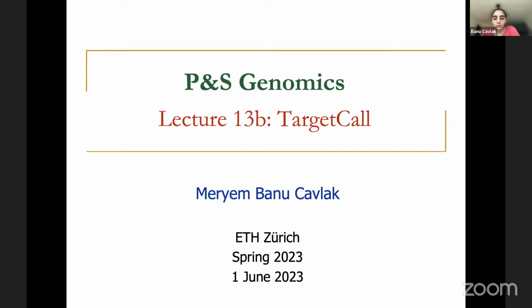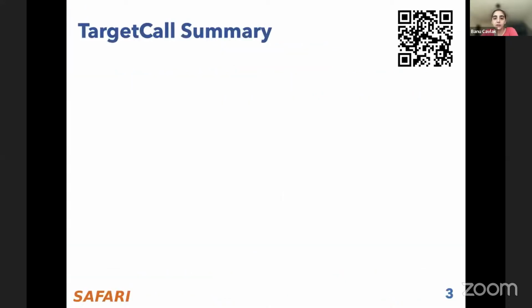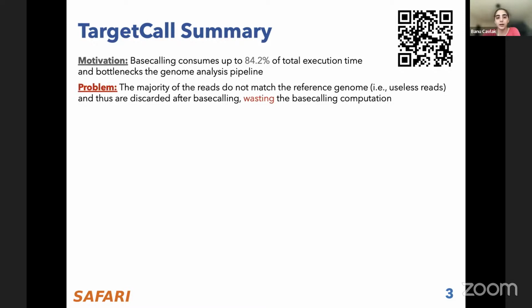Hi, I'm Banu and I will present TargetCall, which is analyzing these nanopore signals in a different way. The title of our work is Eliminating the Wasted Computation in Basecalling via Pre-Basecalling Filtering. And our summary is, we realize that basecalling can consume up to 84.2% of the total execution time in the entire genome analysis pipeline, and it becomes a bottleneck for this pipeline.